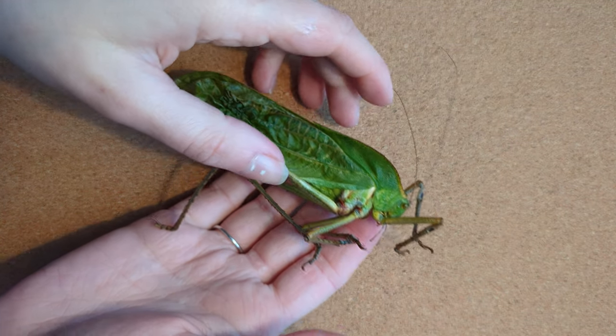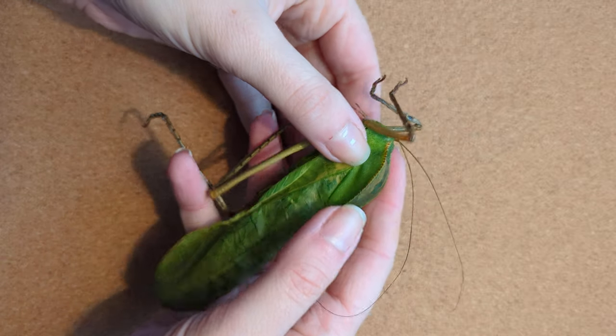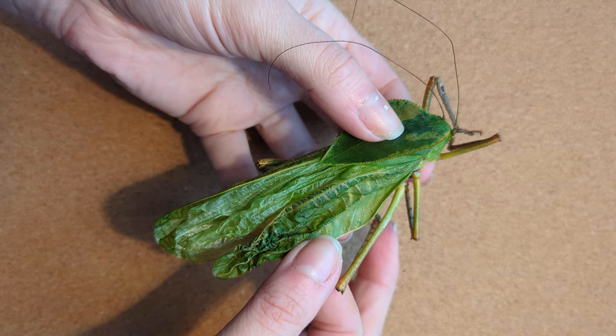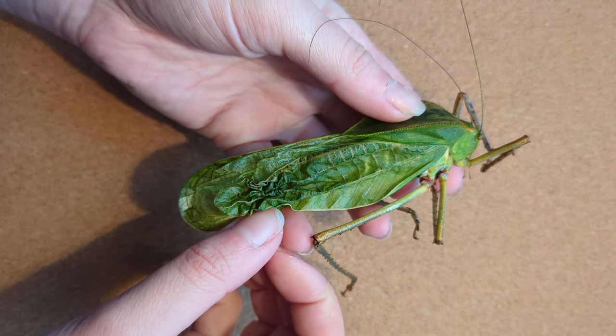Hello and welcome back to another entomological tutorial. Today we're going to be preserving this giant katydid. This is one I've raised myself; unfortunately it didn't finish inflating one of its wing cases after it emerged from its final chrysalis, so we're going to attempt to smooth this out.